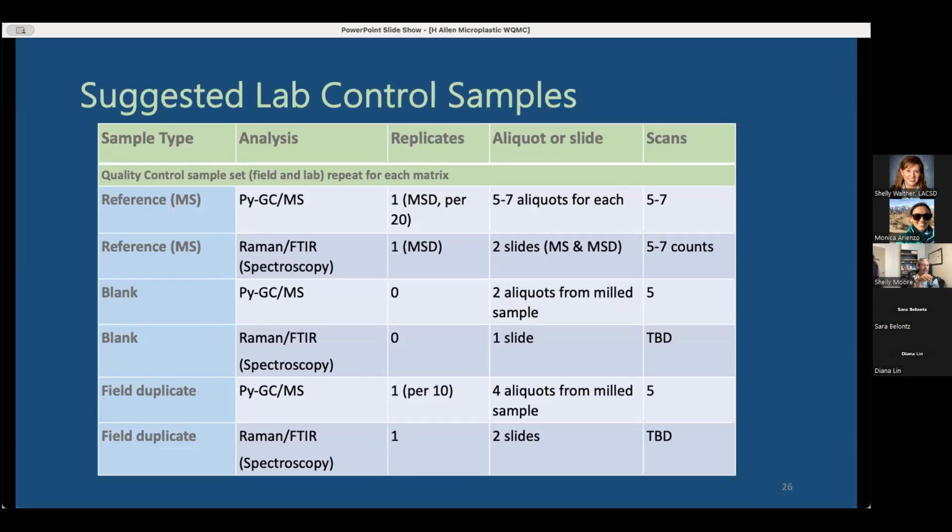With counting, and I was talking about RSDs and RPDs, we think that repeating the counts 5, 6, 7 times, that study of the sediment back east where they looked at the filter size, they counted each of those filter segments 5, 6 times to get a good percent RSD on those, and then they plotted those. So trying to do recounts is really something worth doing.